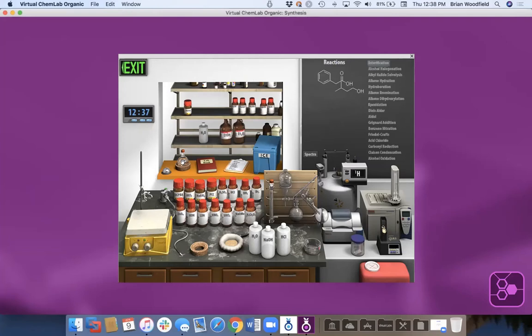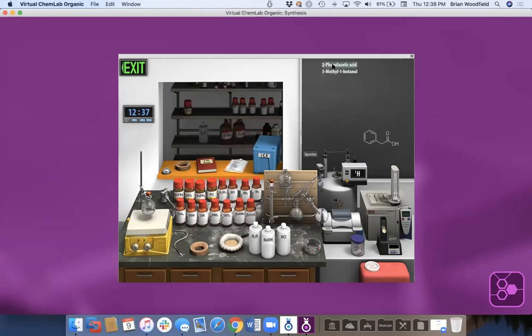So once I've got my starting materials, I'm going to drag my flask to my stir plate. And so this shows me what's in it and their structures. Now, notice that this darkens, so my stockroom is closed. What I can do now is I have these 14 reagents. I can add any of them. So that's the open-endedness of the synthesis. Just because I pick a certain set of starting materials doesn't limit me to the reaction specified or named in those starting materials. It's just a grouping. And so I can do whatever reaction I can try.